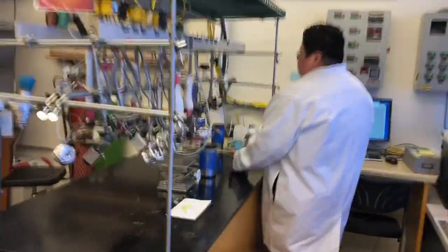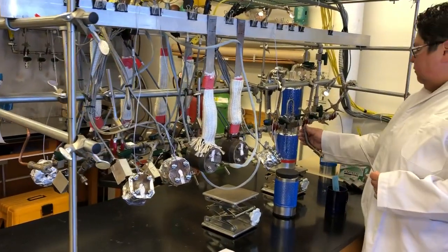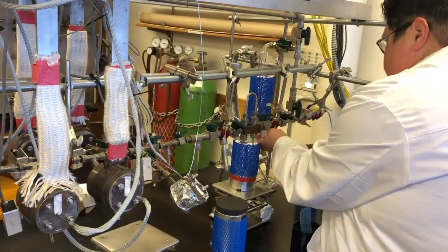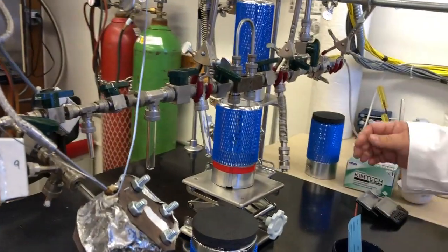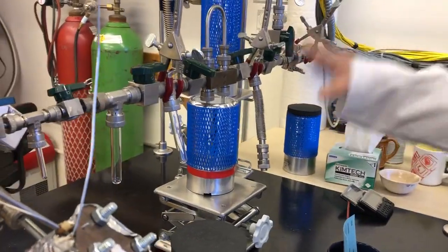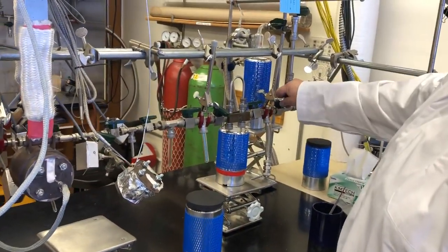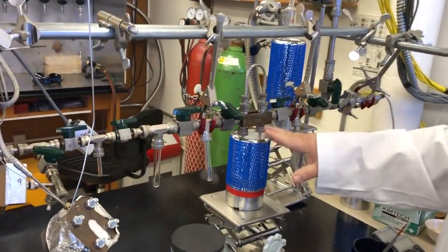So next we come over to my graphite ring. Now this is where the magic really happens. I'm going to take this sample. Now this whole line is currently under vacuum, but I can isolate different ports in order to manipulate the sample. Sometimes you get a little bit of sticky in there. All right. So now I've introduced air to this area, so what I need to do is evacuate it, just like I did on the vacuum line. Now once I get this evacuated, I am able to crack the sample to actually break the glass and release the gas into this cold trap.